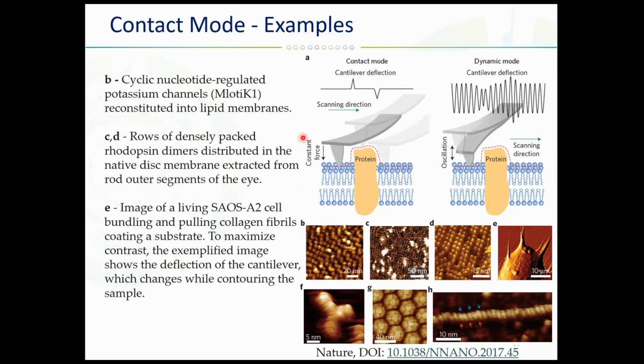So this is another example of contact mode AFM. So I think you might have some idea that usually contact mode AFM is used to characterize more or less solid substrates. And for soft biological systems, it requires some sort of skill, so you do not destroy your sample.